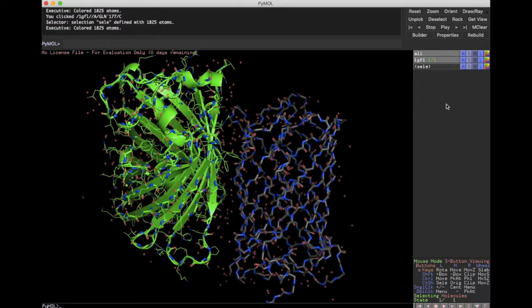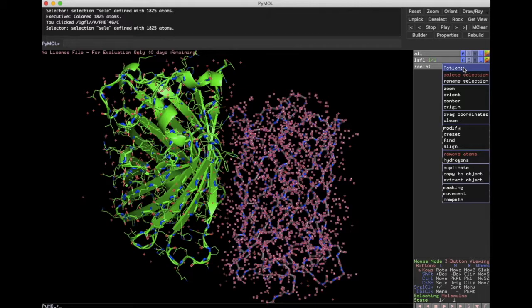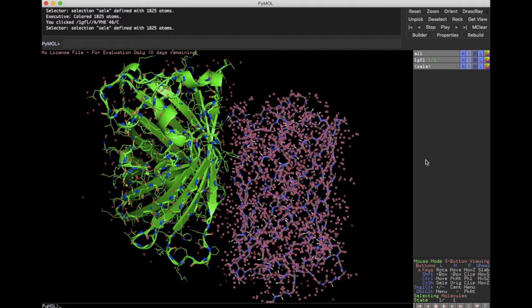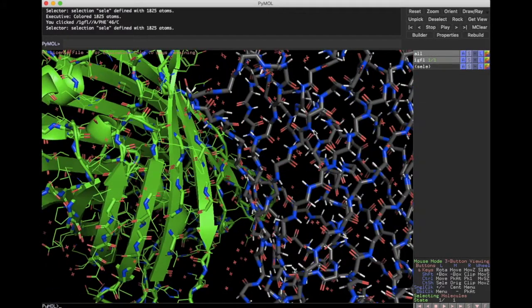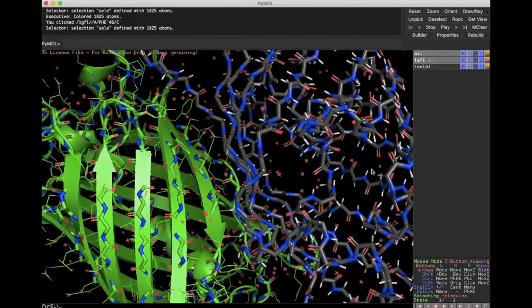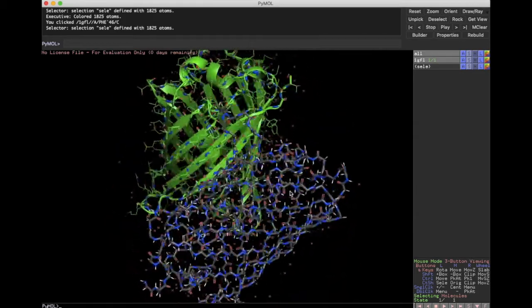And we can't really see the hydrogens here, but let's show those. So if we go click on this, and then again, we're working on the selection area here. If I go action, hydrogens, and I want to add the hydrogens, now you can see them all visible, all right? So all of the hydrogens on the backbone are now visible, and they are white, which follows the international standard, all right?